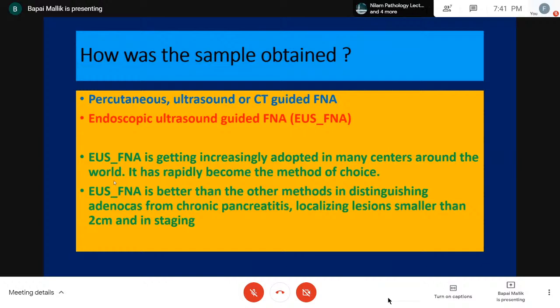Luckily, at the place where I work, the gastroenterologists that work with us are extremely good at getting good samples, and we have seen that our non-diagnostic rates are extremely low. So most of the time, we are able to give them a very specific diagnosis. And under various circumstances, I can tell you that they go ahead with their therapeutic decision without doing a biopsy. Mostly what I'm talking about is in case of solid lesions, of course in cystic lesions too.